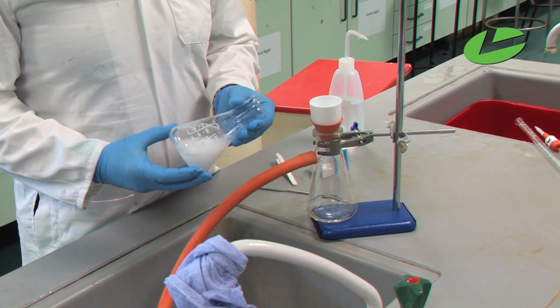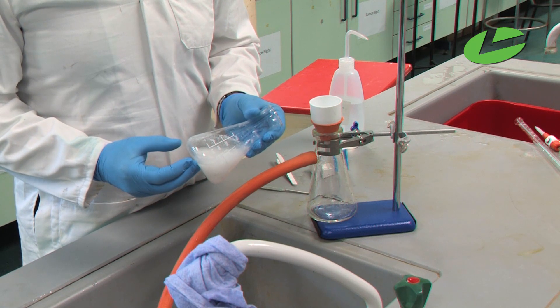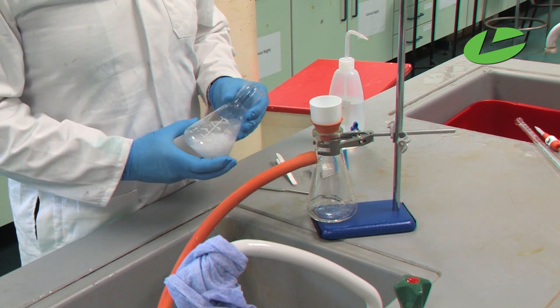You can see in our flask we have benzoic acid crystals floating in the solution. We want to separate our benzoic acid crystals from that solution, and to do that we use a Buchner filtration apparatus.